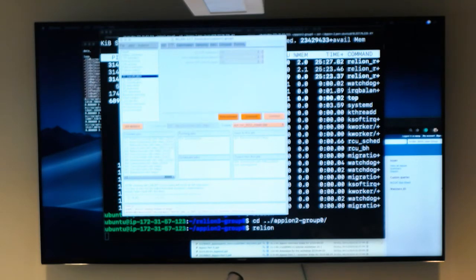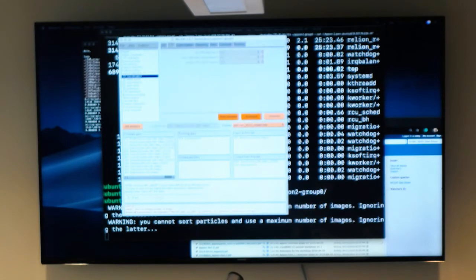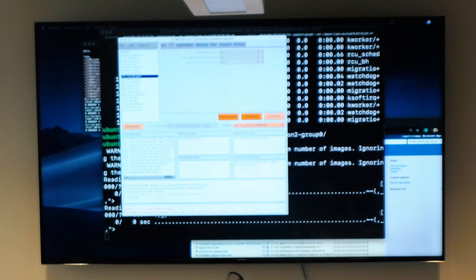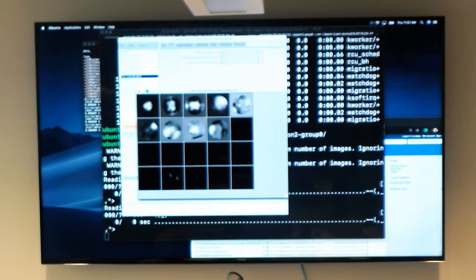That may be something that you don't mind or something that you do care about, in the sense that if you have particles with high symmetry, what could happen is that many classes merge into one class. That may be useful to know. So for example, in this case, though I specified several classes, you can see really everything collapsed into only a couple of main classes.